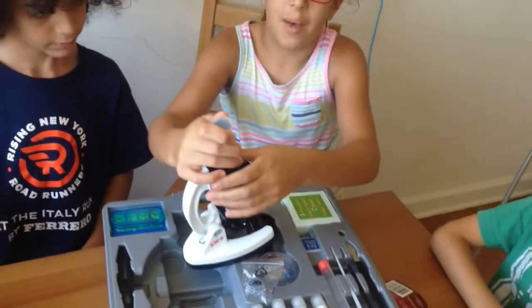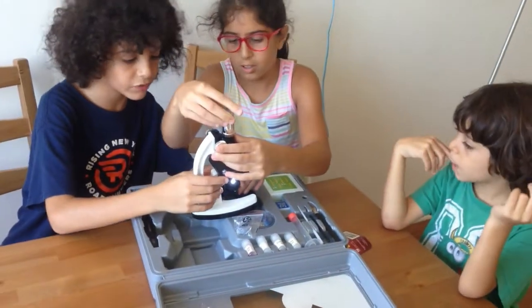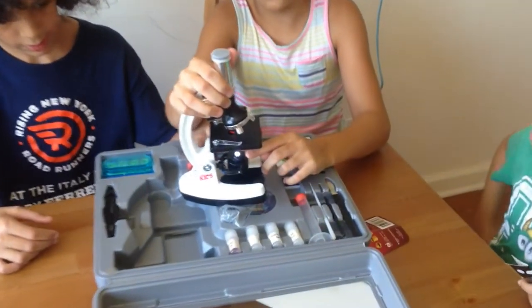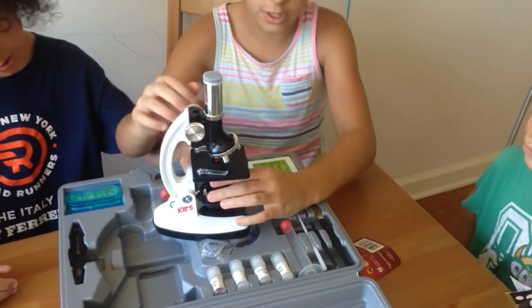Here's the microscope. It has a cap on the top, so remember to take it off. When you flip this, the light comes on — there should be a light down here. You need to turn on the light when you're looking at something, and then you flip it over so you don't waste its batteries.